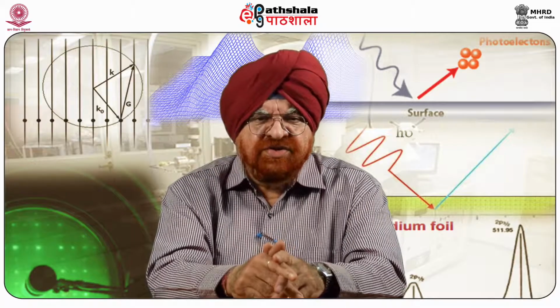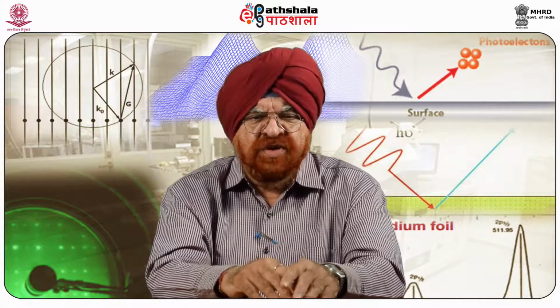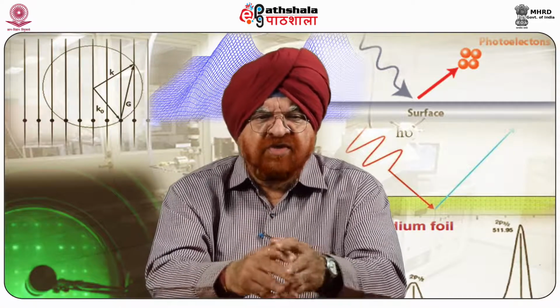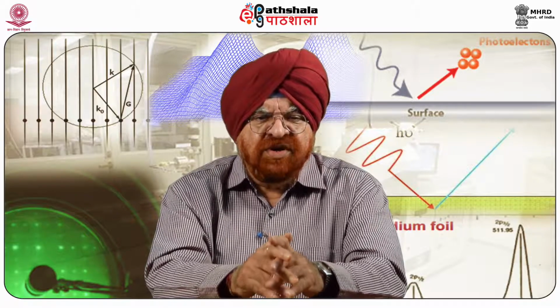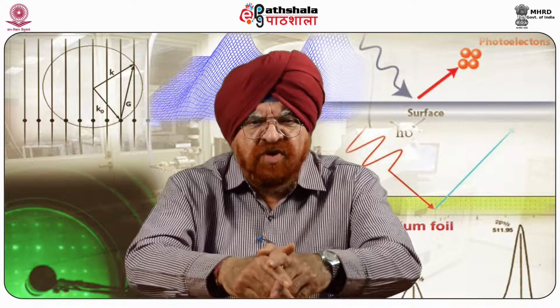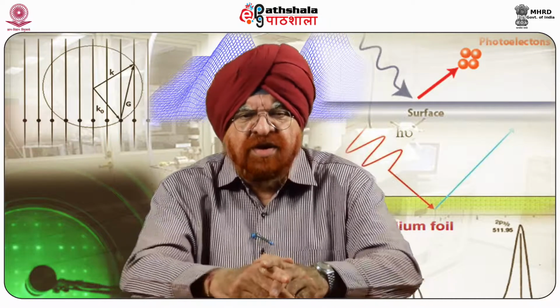Now, when we introduce this, we realize that scanning probe microscopy is a branch of microscopy that forms images of surfaces using a physical probe that scans the specimen. It is one of the powerful modern research techniques that allows us to investigate the morphology and the local properties of a solid body surface with high spatial resolution. The first scanning probe microscope was invented in 1981 by Binnig and Rohrer.